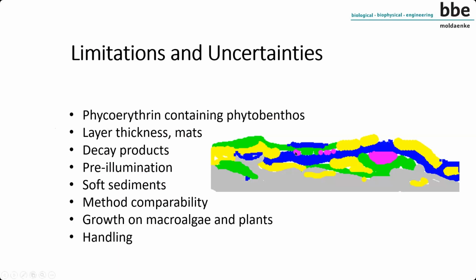So that means that we have some of the Microphytobenthos which are related to the cyanobacteria with phycoerythrin. They are not well represented. The same stands also for the rhodophytes, red algae. We have also higher amounts of phycoerythrin which cannot be seen in that high amount. Microphytobenthos red algae here in our area are really rare, so we did not realize them. Mainly, we saw them mostly as macrophytes.